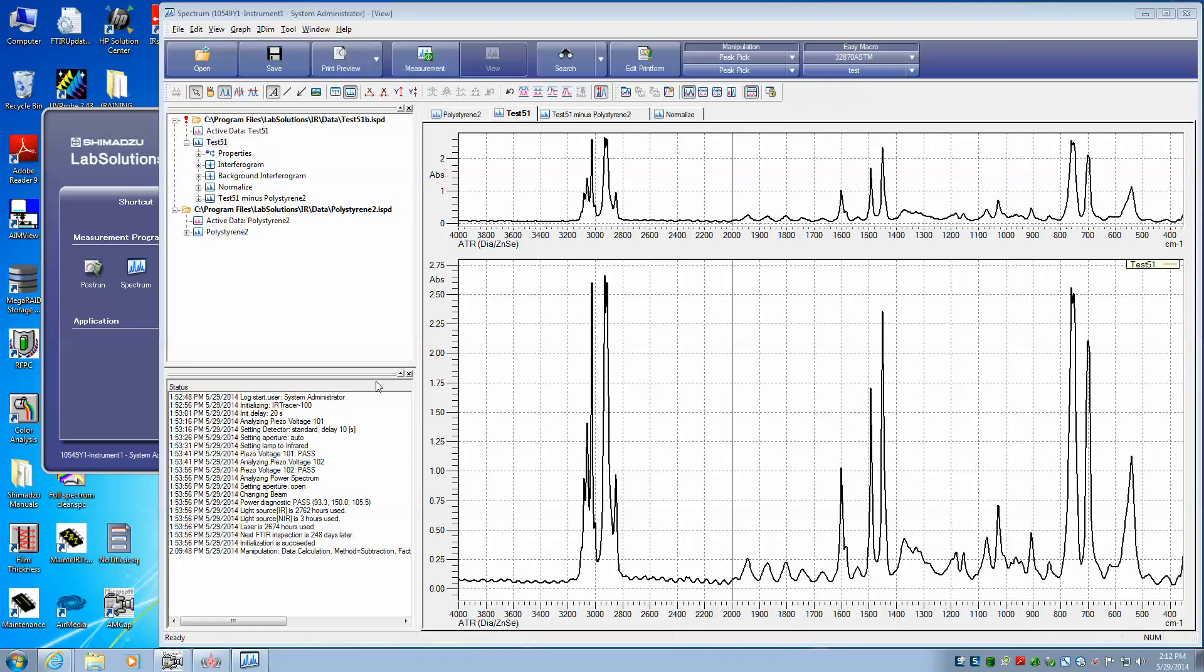Okay, now we have our two files saved here. We have test 51 which we have acquired, and we have the saved spectrum polystyrene.